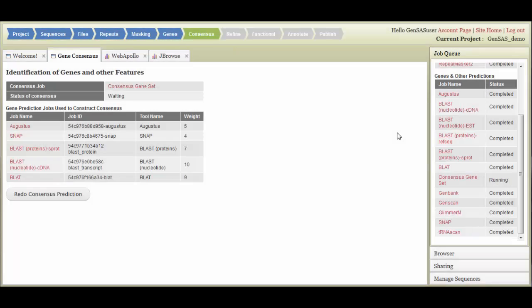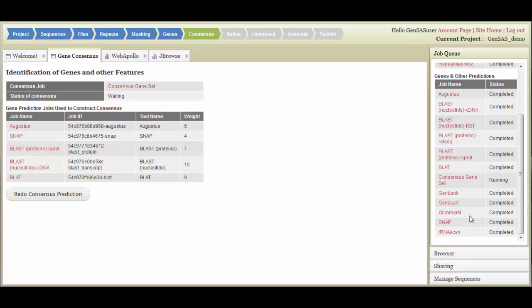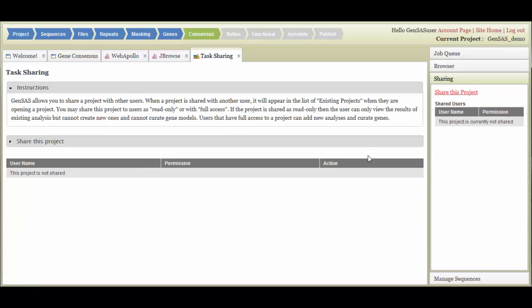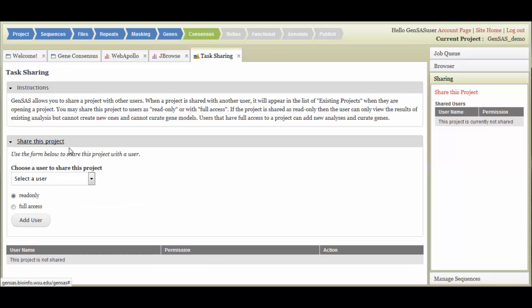Once your project has data, you can share it with other GenSaaS users. To share a project, click on the Sharing section of the right-hand menu. Then click on Share this project to open the Sharing tab. You then just need to select the GenSaaS user from the drop-down menu and choose the level of sharing. Read-only users will only be able to view the data. Full-axis users will be able to start jobs and edit the annotation in WebApollo.